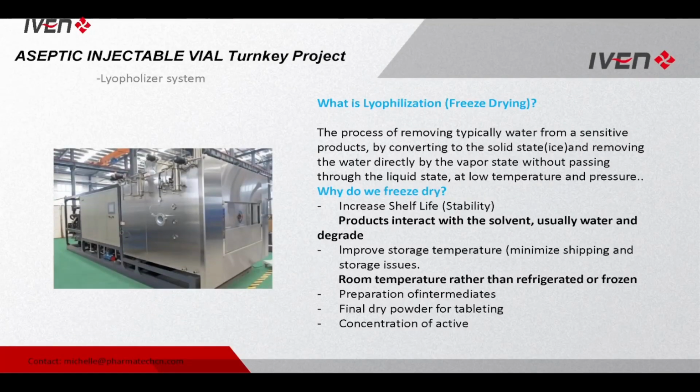For some special products, we also need a lyophilizer. So what is a lyophilizer? The lyophilizer is a process that removes the water from sensitive products by converting it from liquid to solid. So why do we need freeze drying?